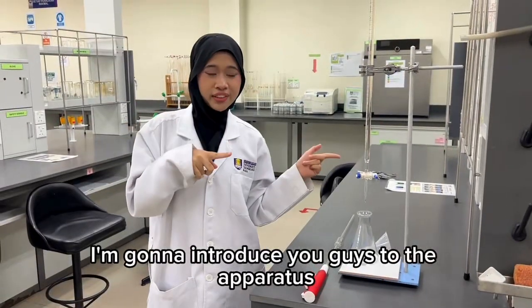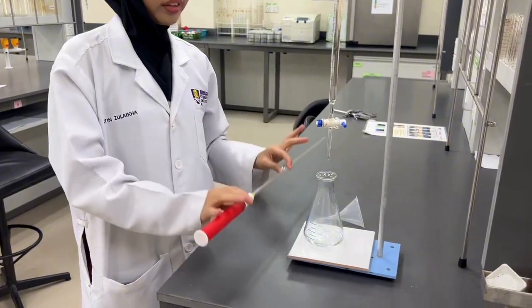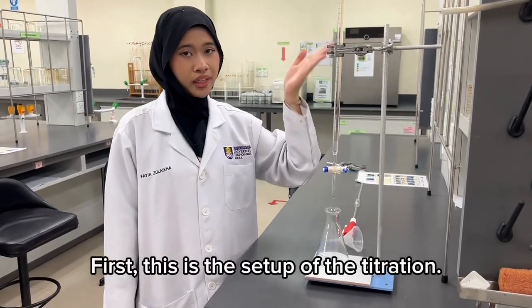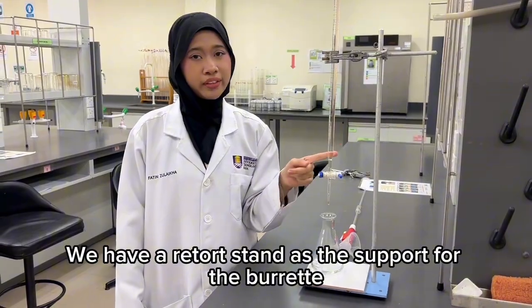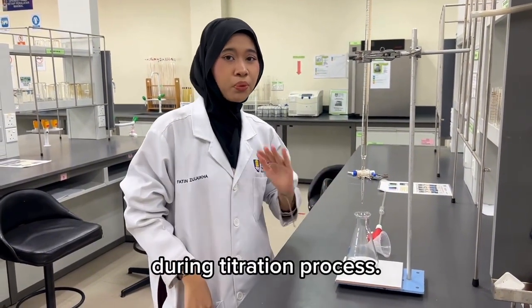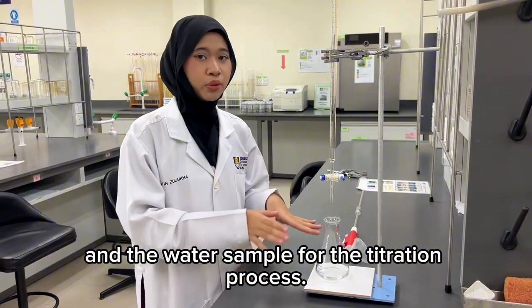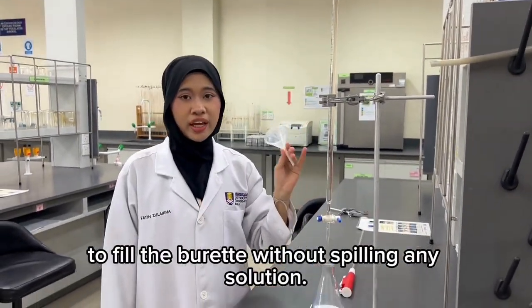I'm going to introduce you to the apparatus that we are going to use in titration. We have a pipette, a funnel, a white tile, a conical flask and a burette. First, this is the setup of the titration. We have a retort stand as the support for the burette. The burette allows acid to be added slowly and accurately during the titration process. We have a conical flask where the reaction takes place. This is where we add the indicator and the water sample for the titration process. Next, we also have a funnel to fill the burette without spilling any solution.